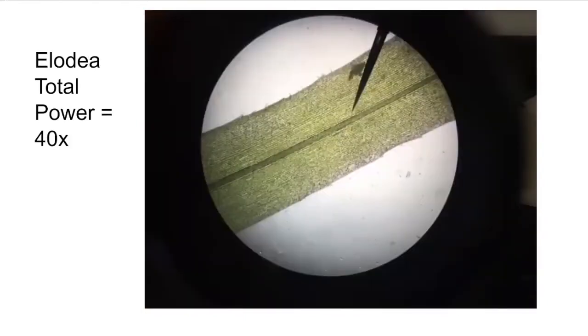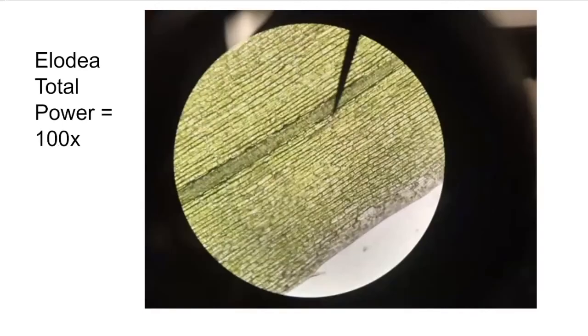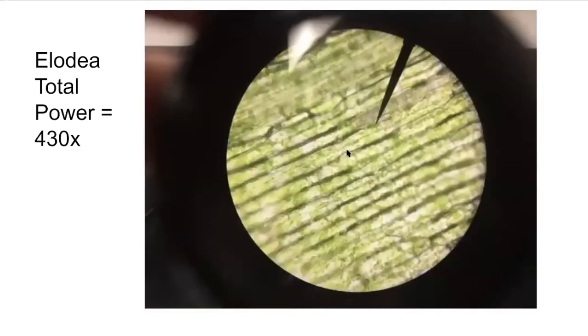So this is our elodea on low power on 40 times magnification. As we increase to more detail at 100 times magnification, you can see that we still have the rectangular shape to these cells. And as we go to 430 times magnification, we can see even more detail. So we have the cell wall, which is the space that you're able to see between these rectangular cells. We have the cytoplasm, which is the inner goop of the cell where all the organelles are going to float around in. And you can see these little green bubbles. And these little green bubbles are chloroplasts that are responsible for photosynthesis. Now, we're really not able to see the nuclei of these cells because there are so many chloroplasts in them.